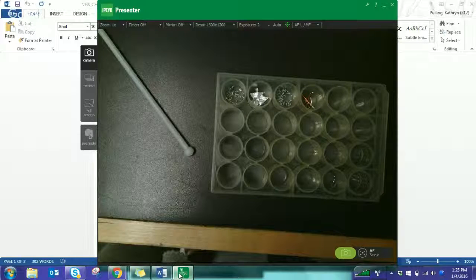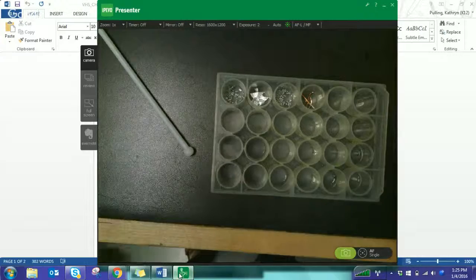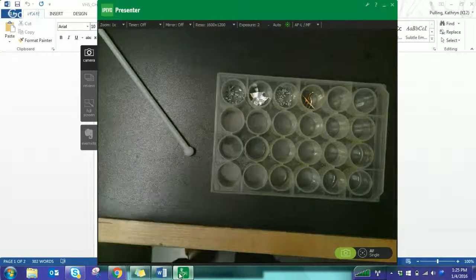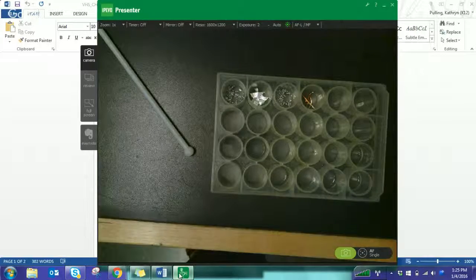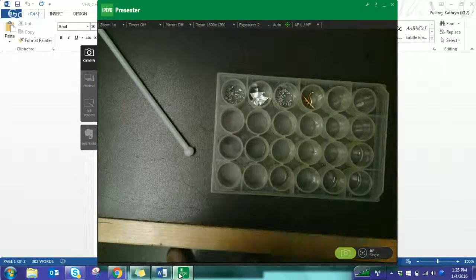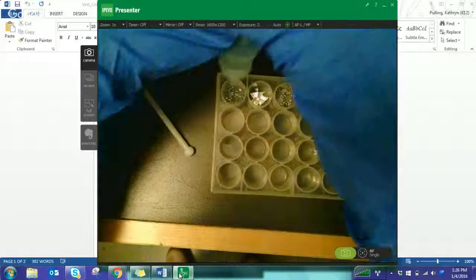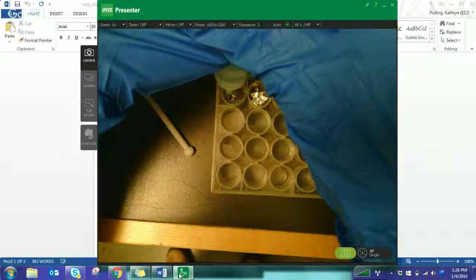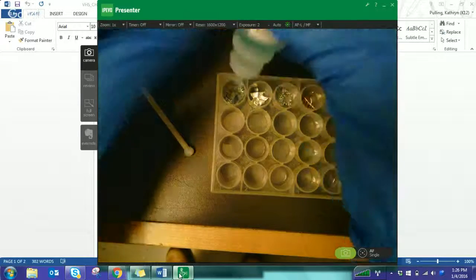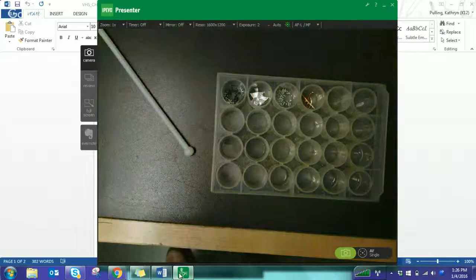Add approximately 25 drops of each solution listed in table 1 into the specified well. So, copper sulfate and silver nitrate. Let's do the copper sulfate with the zinc and the aluminum first. If we get any reactions, then we'll talk. 1, 2, 3, 4, 5, 6, 7, 8, 9, 10, 11, 12, 13, 14, 15, 16, 17, 18. I don't think I even need 20 for you to be able to tell what's going on there.